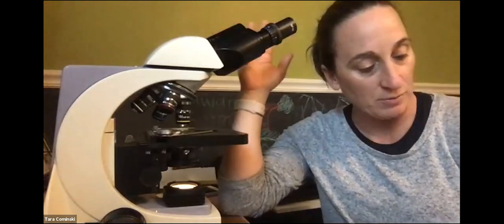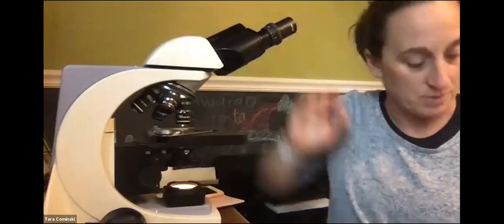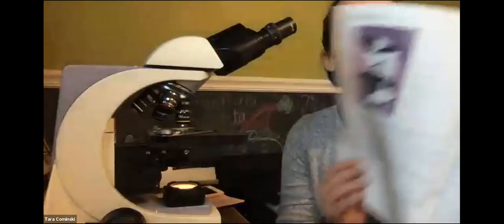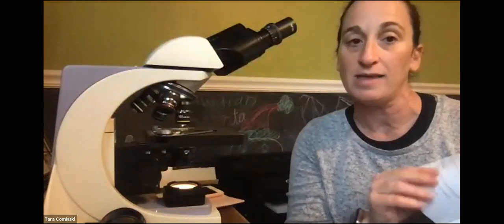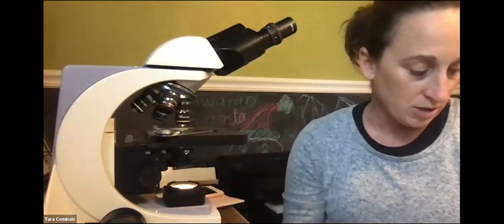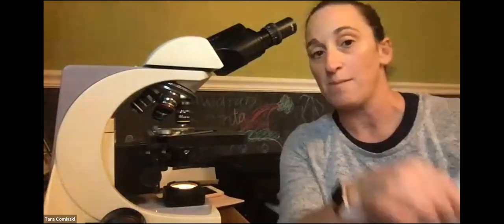Just to review, eyepieces are here, or ocular lens, right? There is a diagram on the next page that you are required to complete. You're going to fill in that diagram, okay? That's part of your assignment. It also says on number 1, identifying the parts. We're going through these parts so we should be able to label them on here, but I'm also pointing them out live on the microscope.